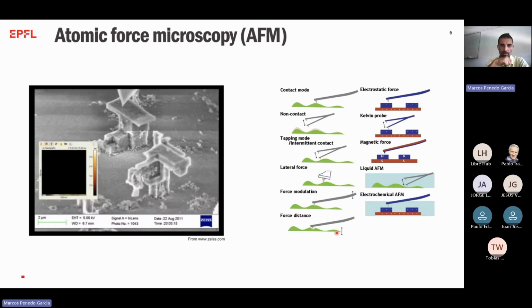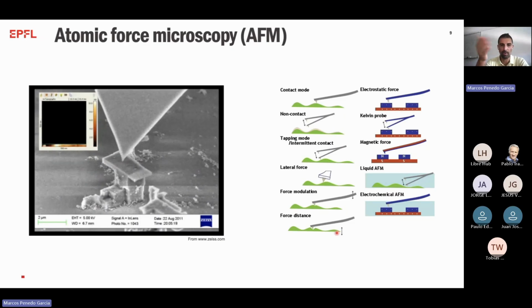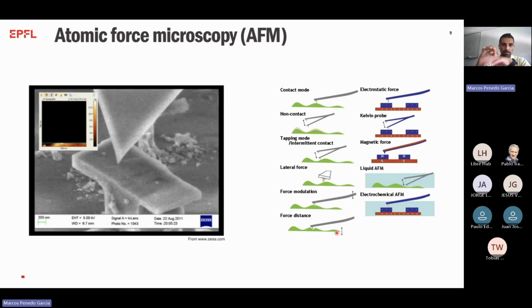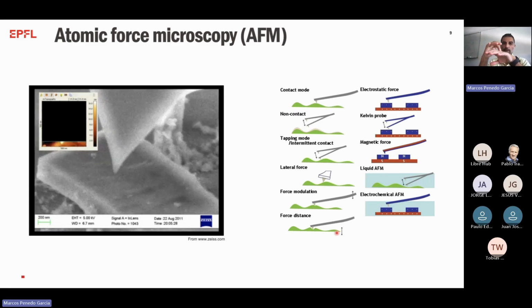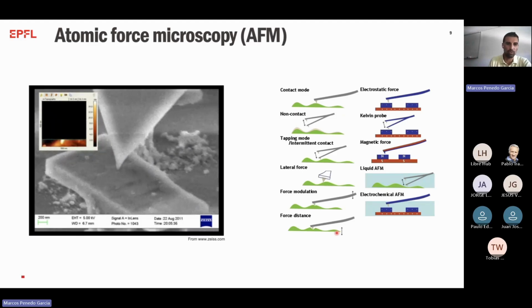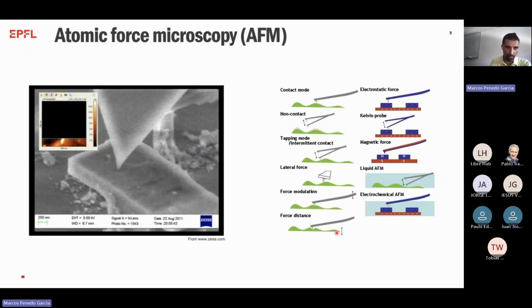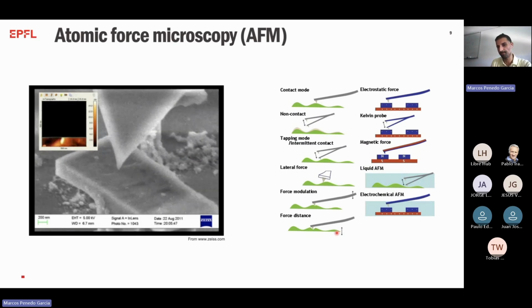and you start to probe the surface. In this case, the technique first developed for the AFM, that is contact mode. You just go to the surface. You can read the deflection of the cantilever when it finds something. If you have, for example, a feature on the surface, it's going to bend the cantilever, and then you can generate a topographical image, or you can keep that deflection constant, moving the sample up and down. That also will be a mirror of the topographical surface.